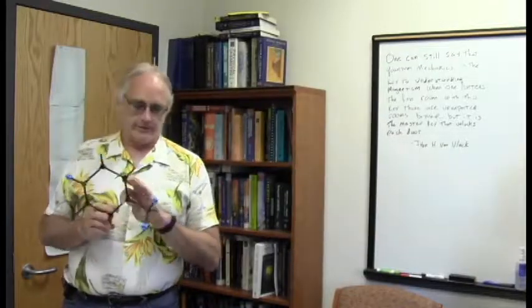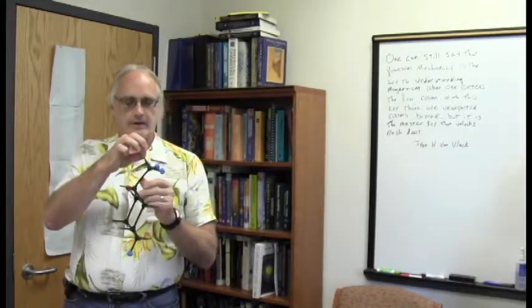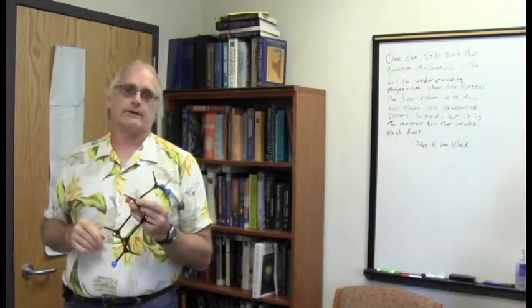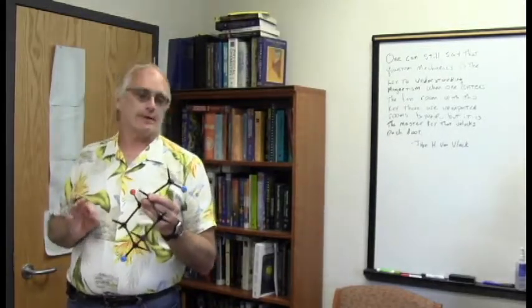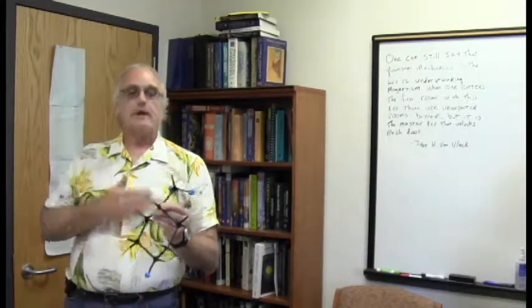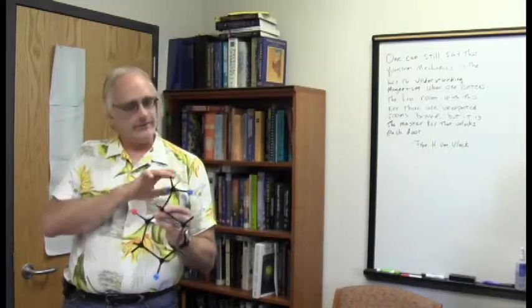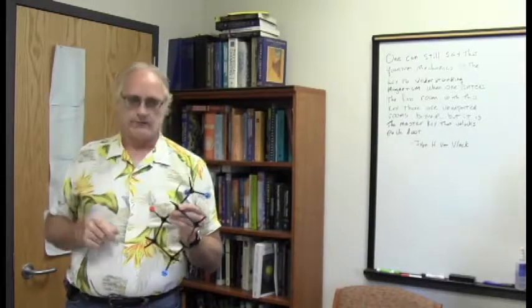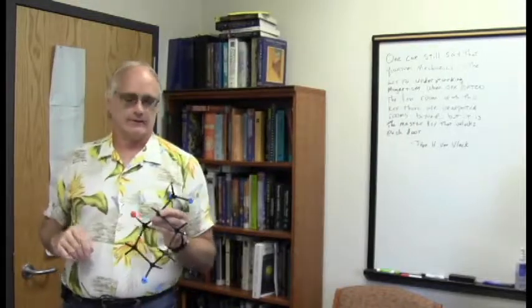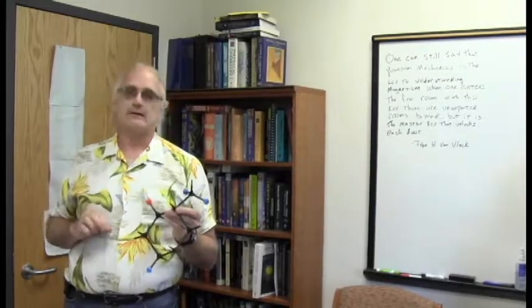Now there's one other position on this molecule that I think is going to be pretty obvious, and this is the world famous septet of doublets. It's going to be this one here. It's the only position in this molecule that could ever have that extensive a coupling pattern. It is 3 bonds away from these 2 methyl groups. The 2 methyl groups, recall, even from the DEPT spectra, are not equivalent to each other, even if they're attached to the same carbon. This molecule is full of chiral centers, and so if the methyl groups aren't equivalent, the CH2s out here in the ring are not going to be equivalent as well. We're going to see a lot of that.